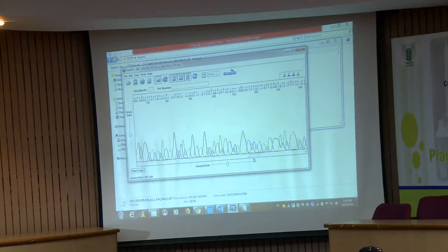Okay, I will not go in deep, but for high-end sequencing, this NGS and all, they are sequencing it 100x, 1000x, just to make sure, because they want to clear off the error, so that there should not be any error in that particular sequence. The deeper you go, the more times you sequence it, the more times you get it confirmed that yes, this is the correct base.